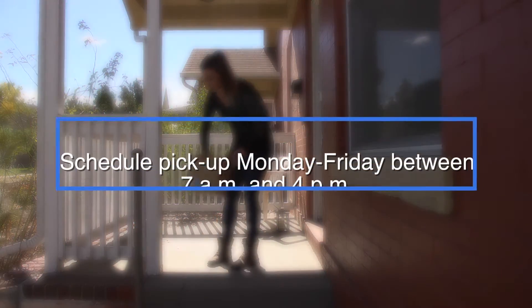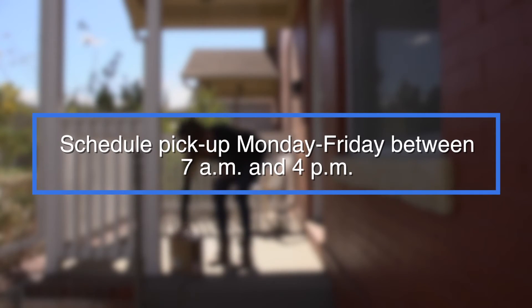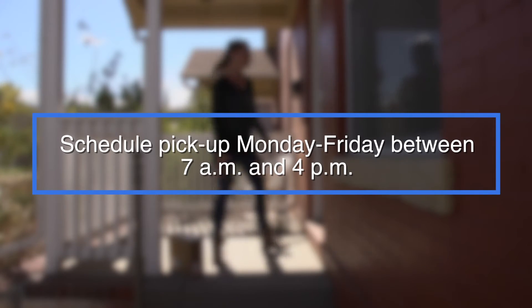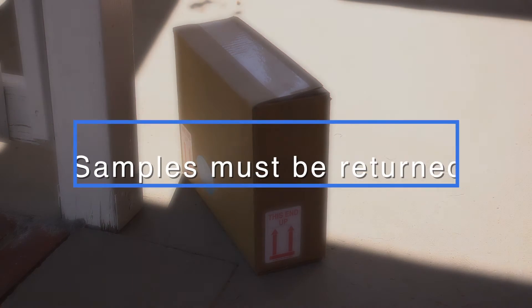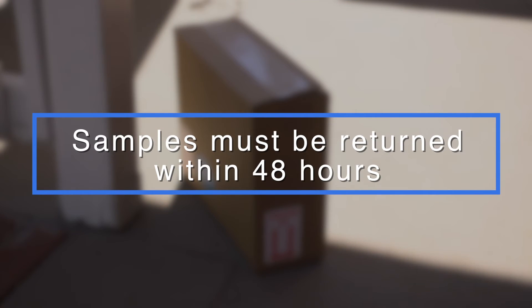Place the box outside and schedule pickup for Monday through Friday between 7 a.m. and 4 p.m. For reliable test results, the samples must be returned to Denver Water within 48 hours, so be sure to schedule your sampling and pickup times appropriately.